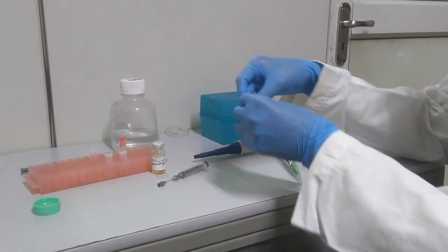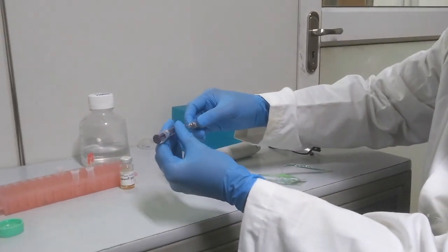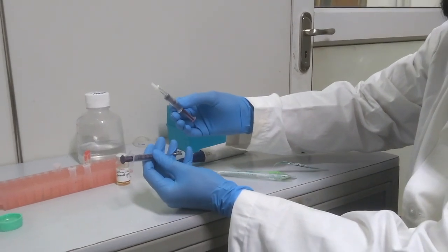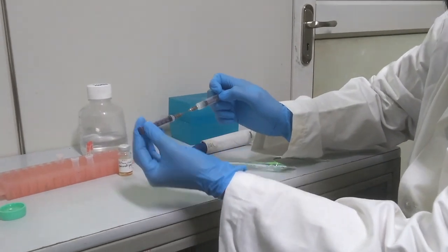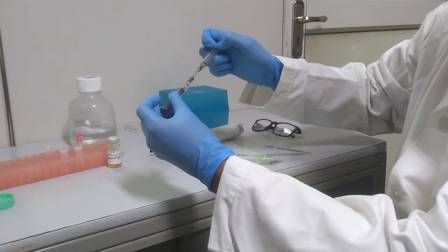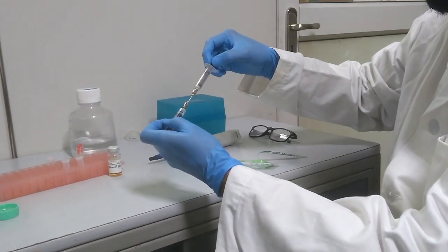attach another syringe into it, like this. So once you have filled your antigen and the adjuvant in this needle, you push it here, and then you keep pushing from one side, keep pulling from another side, keep pushing from one side and keep pulling from another side. This process forcefully pushes your material, the oil and the antigen, through this fine needle, and in that process, the emulsion is formed.